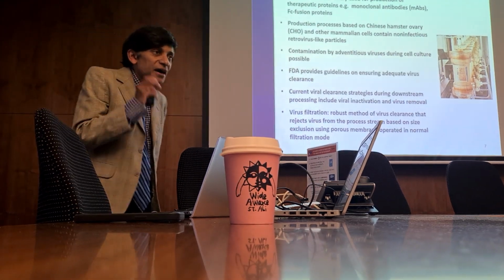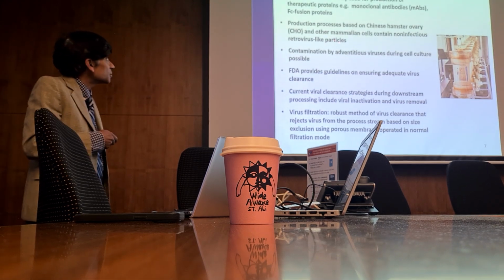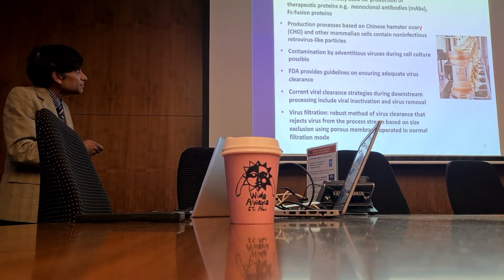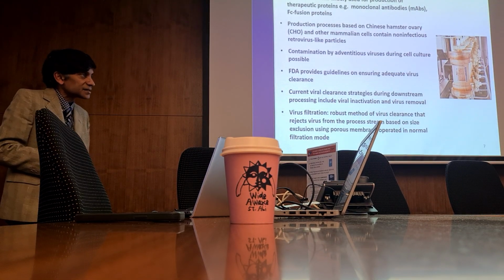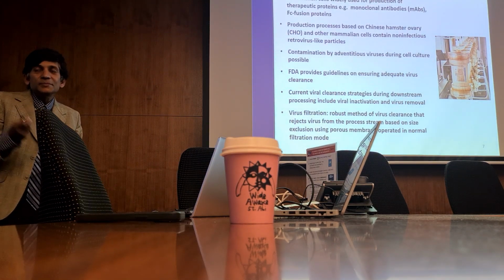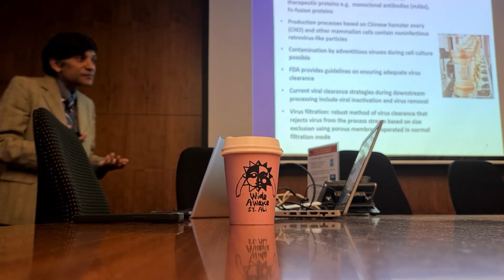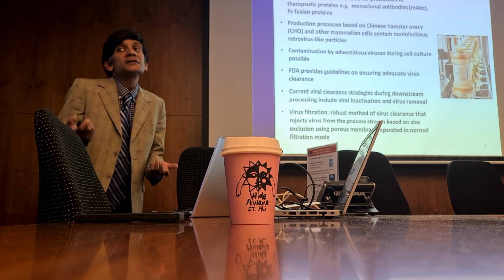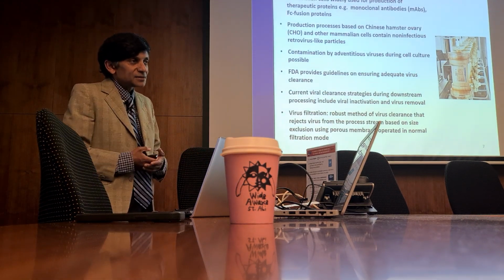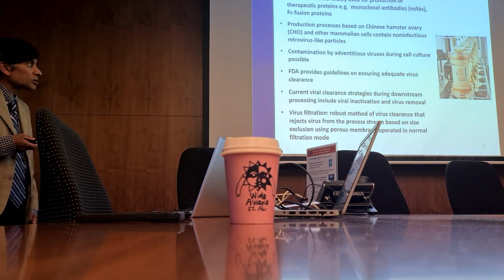Now I'm going to focus on virus removal and virus purification, since that's an interesting area and something that we work with. So these mammalian cells produce virus particles. They naturally produce non-infective, what are called retrovirus-like particles. So you have to show that they are removed from your product. You're not going to give someone a product which is contaminated with these virus particles. They may be non-infective, but they can still cause very serious side effects. So this is a very, very serious problem. It's in fact one of the reasons why gene therapy applications have taken so long to develop. It's been very difficult to actually purify the product.